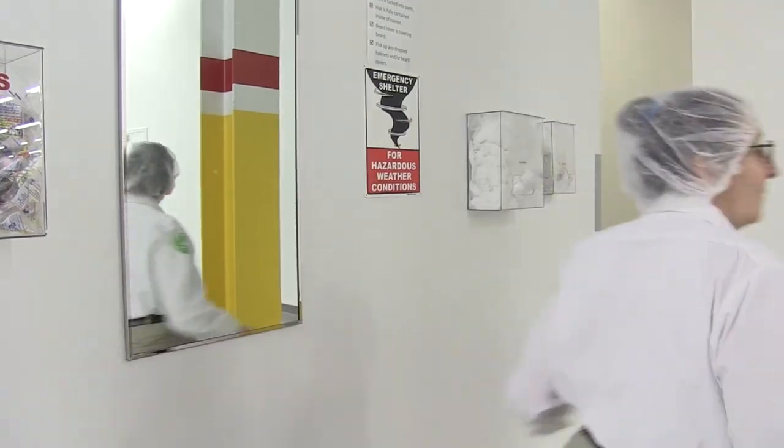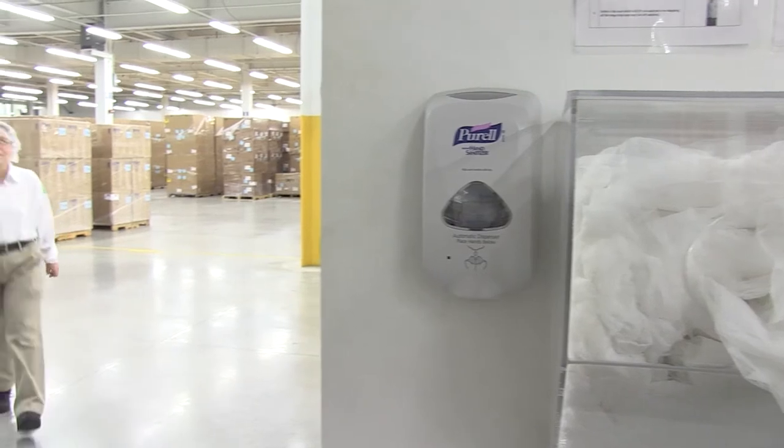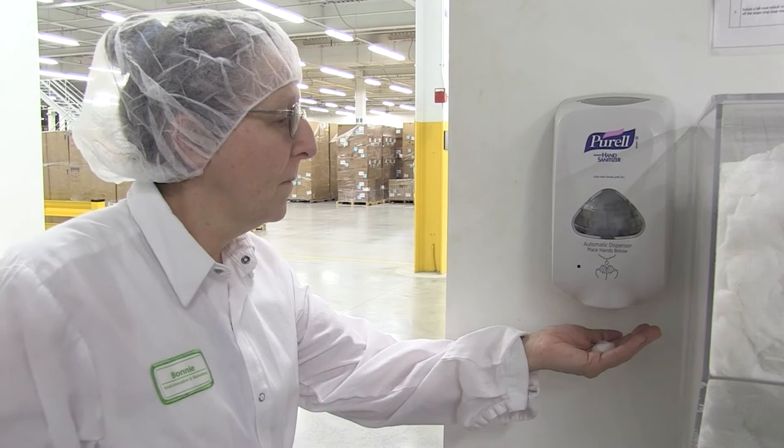Hairnets, beard covers, and shoe covers are some of the requirements of gowning. Gowning protects the employee from the product and the product from the employee.